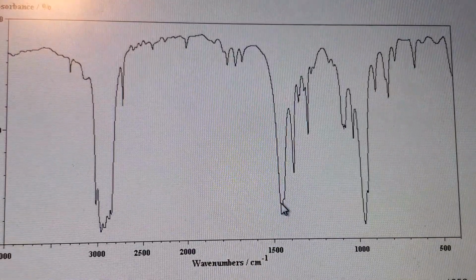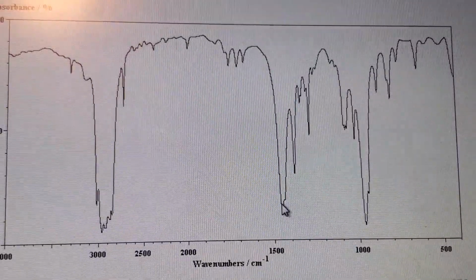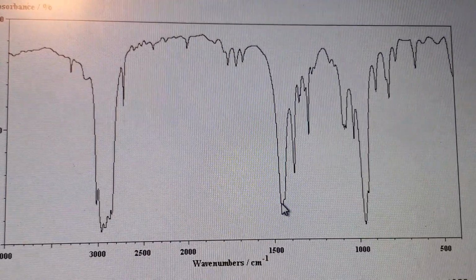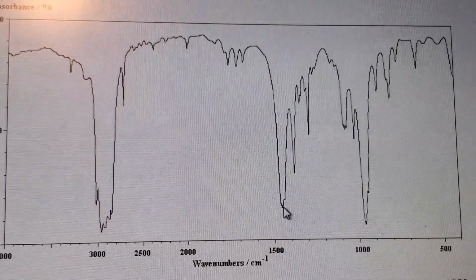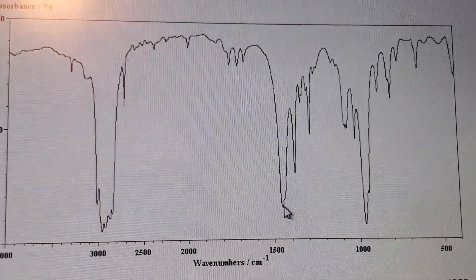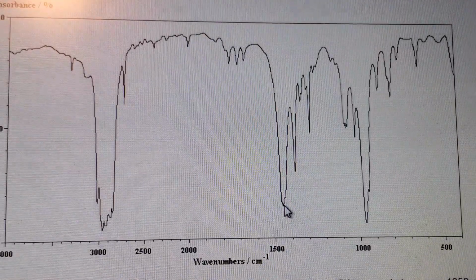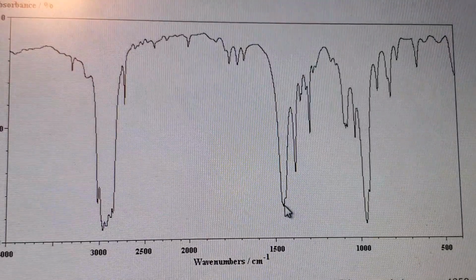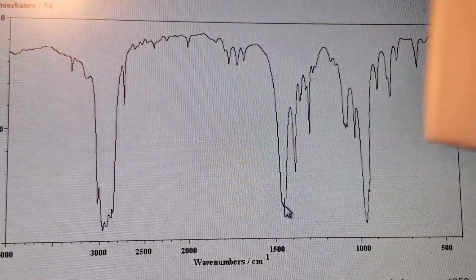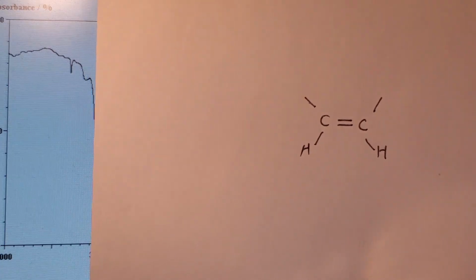If you have a chemical formula given and you find oxygen, then you have to say, oh, there is an oxygen. If it's not the case, there's nothing else but just carbon and hydrogen, then how do you create some dipole moment in the carbon single and double bonded alkene compound? So one proposal is assuming this type of cis form of alkene.